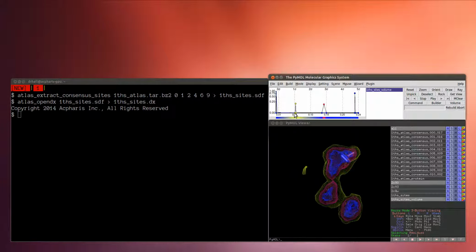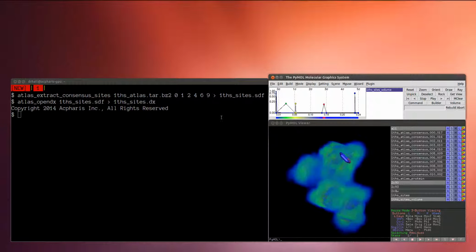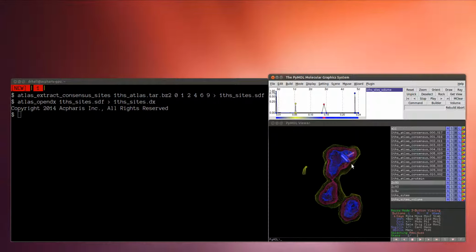If we want to just add a single point rather than a triangle like this, if I click here, it will create a point that reaches out to a point down here at this corner as well. Let's make this green. And I don't really like that. It's a little bit ugly, so if I middle click on a point, I can delete it.